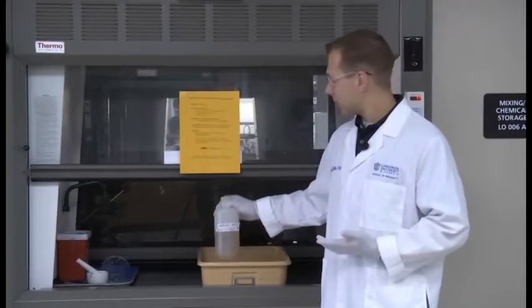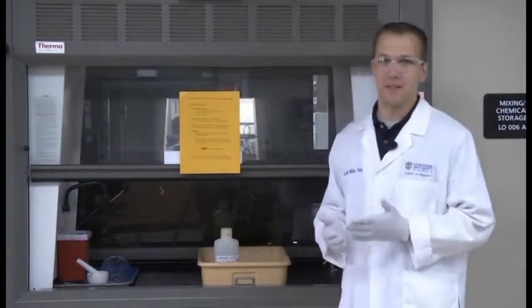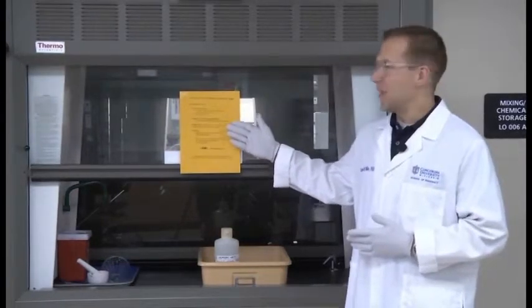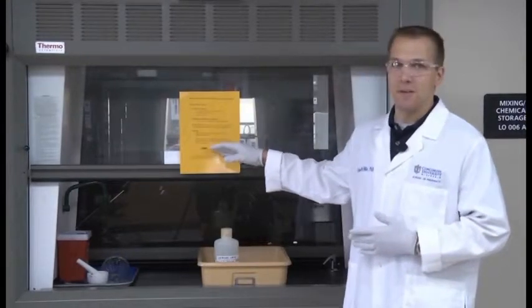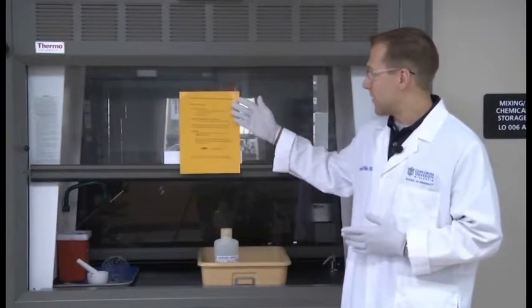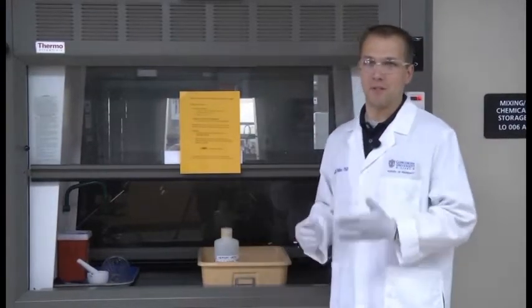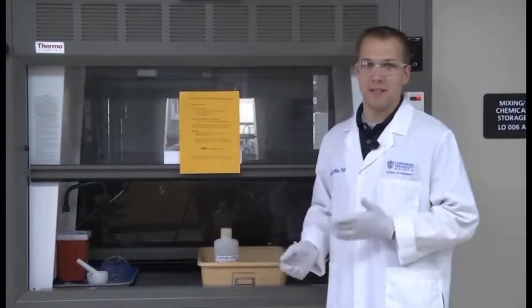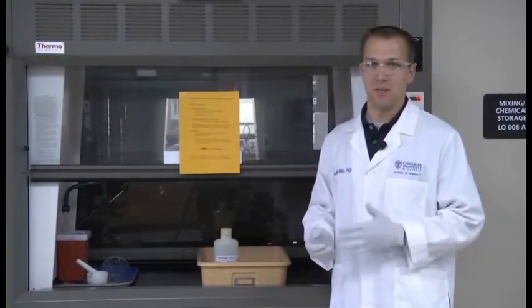Hazardous waste containers are kept in an area of the laboratory that we've designated called the satellite accumulation area. So each laboratory should have one of these areas, and there should be a sign that says satellite accumulation area, and also gives some of the general rules for putting containers in that area and how they should be labeled. So this is the satellite accumulation area for this lab, to keep containers in this area as we're filling them. So if we're generating the same waste over and over, we can keep this container here until it's full and then contact EH&S in order for them to pick up the container and move it to our central waste storage area where it can wait for pickup.